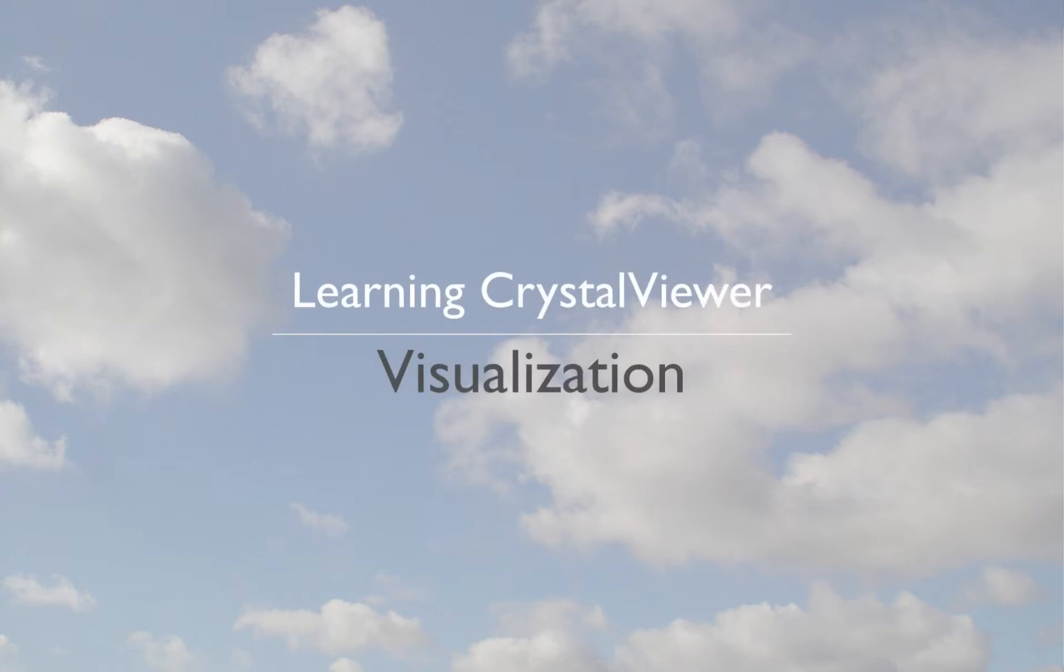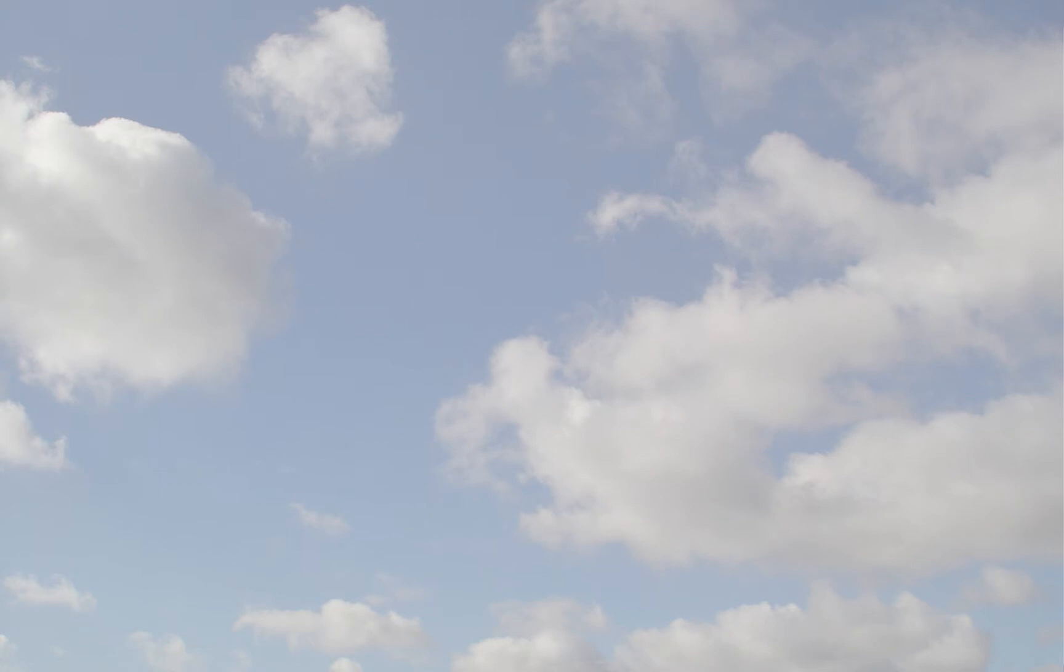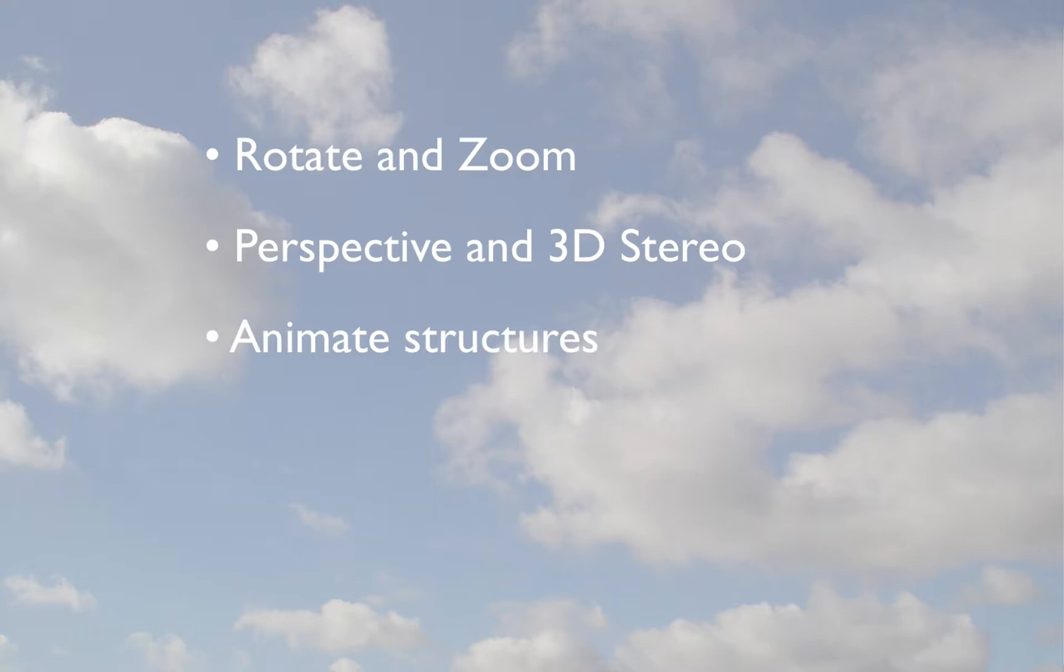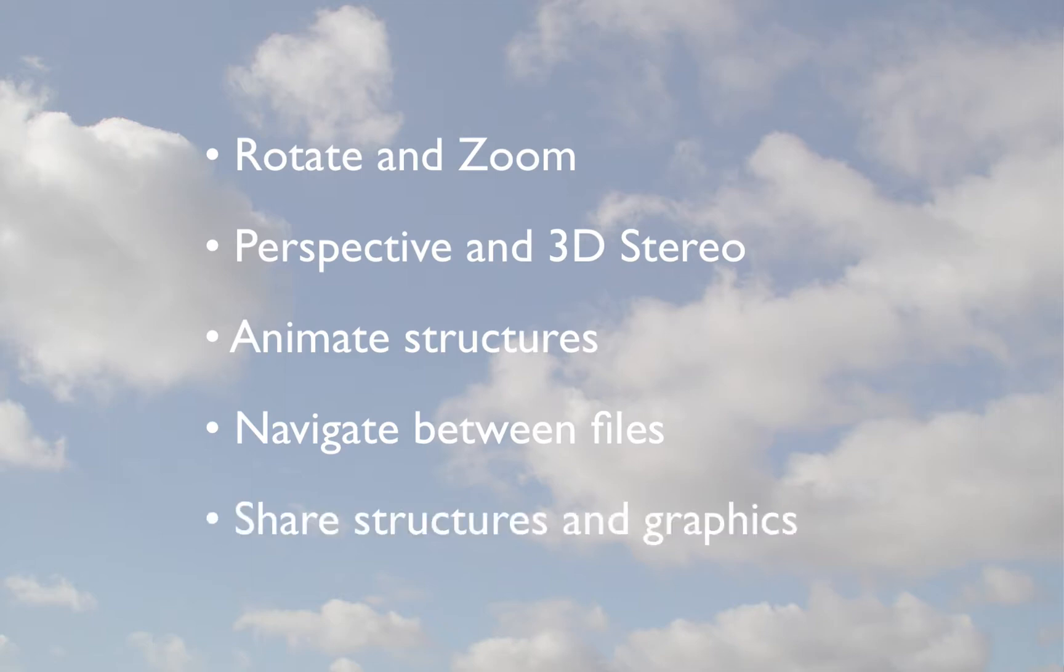Welcome to Crystal Viewer 11. In this tutorial, we'll learn how to visualize crystal and molecular structures, including how to rotate and zoom, use perspective, switch to an out-of-screen 3D stereo mode, animate sequences of structures, navigate between various structures in the current folder, and also learn how to share structures with other programs and how to export graphics.